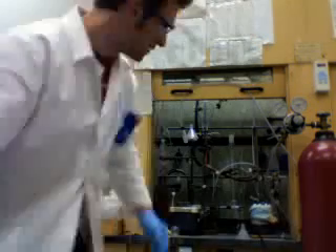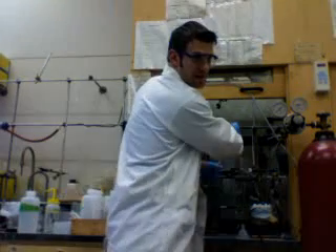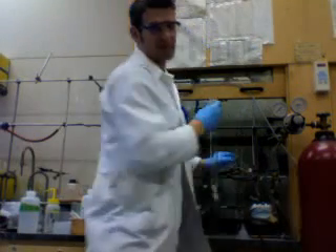Hi there, today we're doing column chromatography. I often get asked what column chromatography is, so I'm just going to quickly run through the basic concepts.